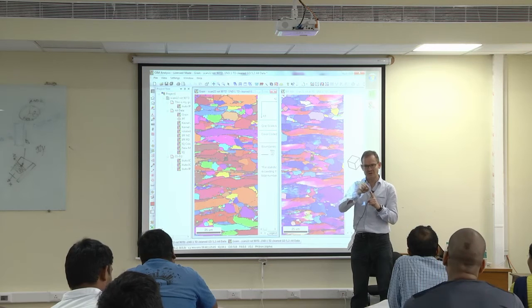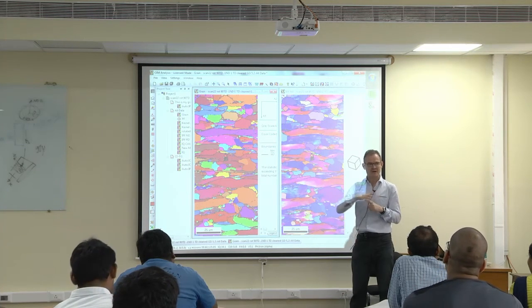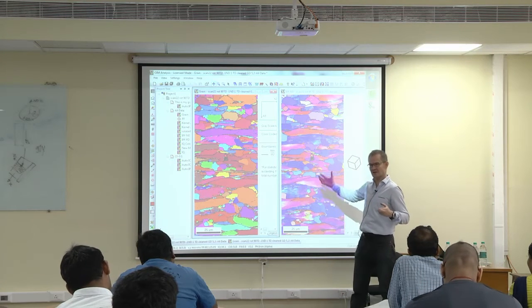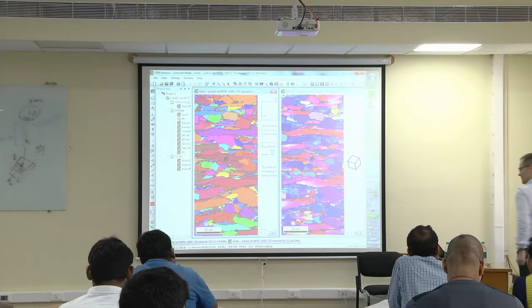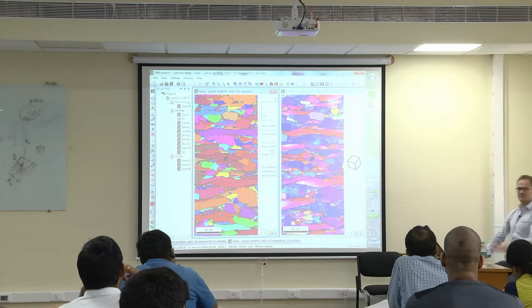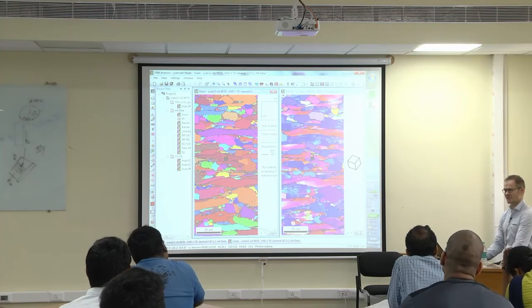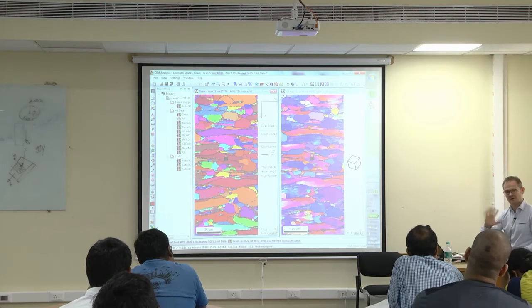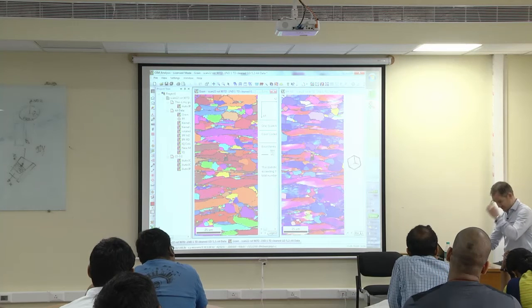And these rules are not only misorientation, but there are more rules, for example the amount of dislocations inside. And then you can start writing your own code which analyzes these maps much more powerfully. In principle, you can export all these data and then start writing your own code. It's fantastic. You use MTEX or you write your own basic crystallography tools. I always had fun with that.